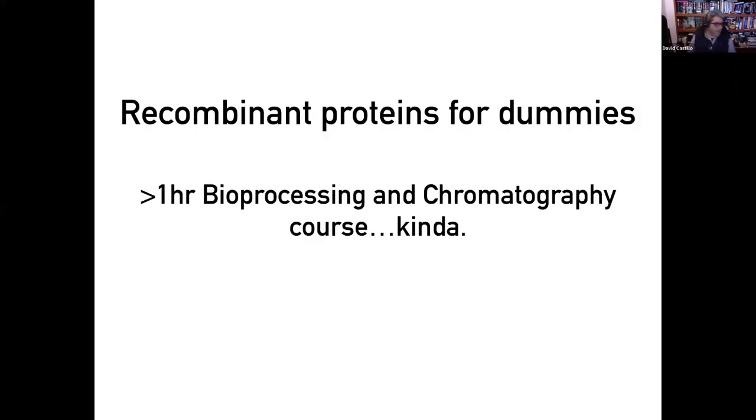So I'm going to do a quick demo of just explaining how to load the media into the bag. But before that, I'd like to quickly review some aspects of what you might actually need. We call it recombinant protein for dummies, which is actually a very bad name. It's more like a chromatography bioprocessing course in less than an hour, which of course is impossible because bioprocessing is more or less 2 or 3 years of a PhD or a master's degree. But anyway, we try to sum up most of the basic concepts that you will need to know whenever you are handling these machines.